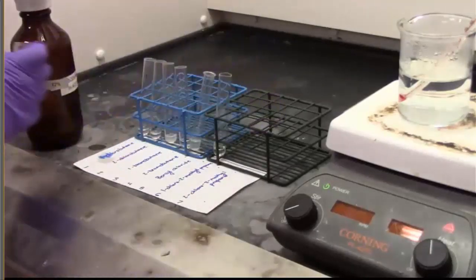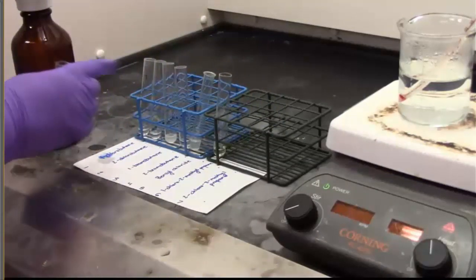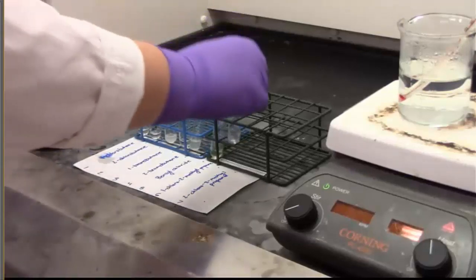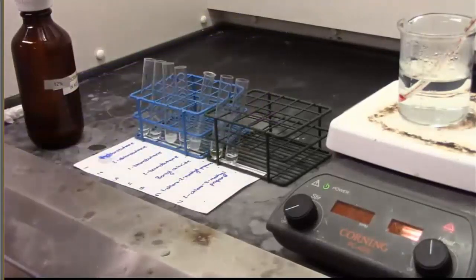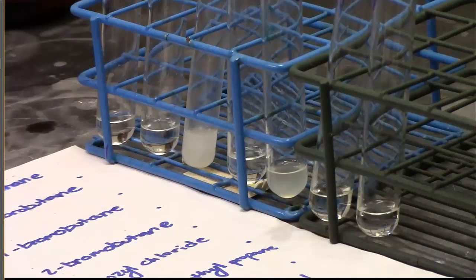We're adding these in 10-second intervals, and if you look at these test tubes, it looks like 2 of them are already starting to turn cloudy. The 1-bromobutane and the benzyl chloride are both already starting to turn cloudy, and it looks like the 1-bromobutane is more cloudy than the benzyl chloride at this point.